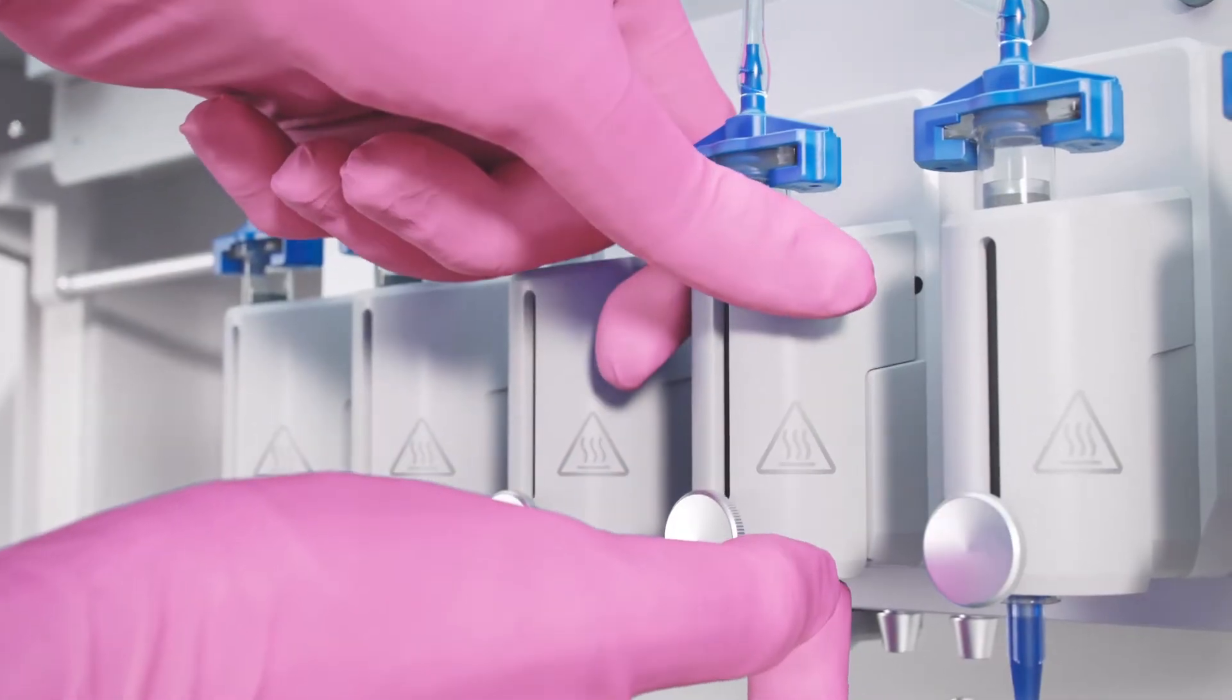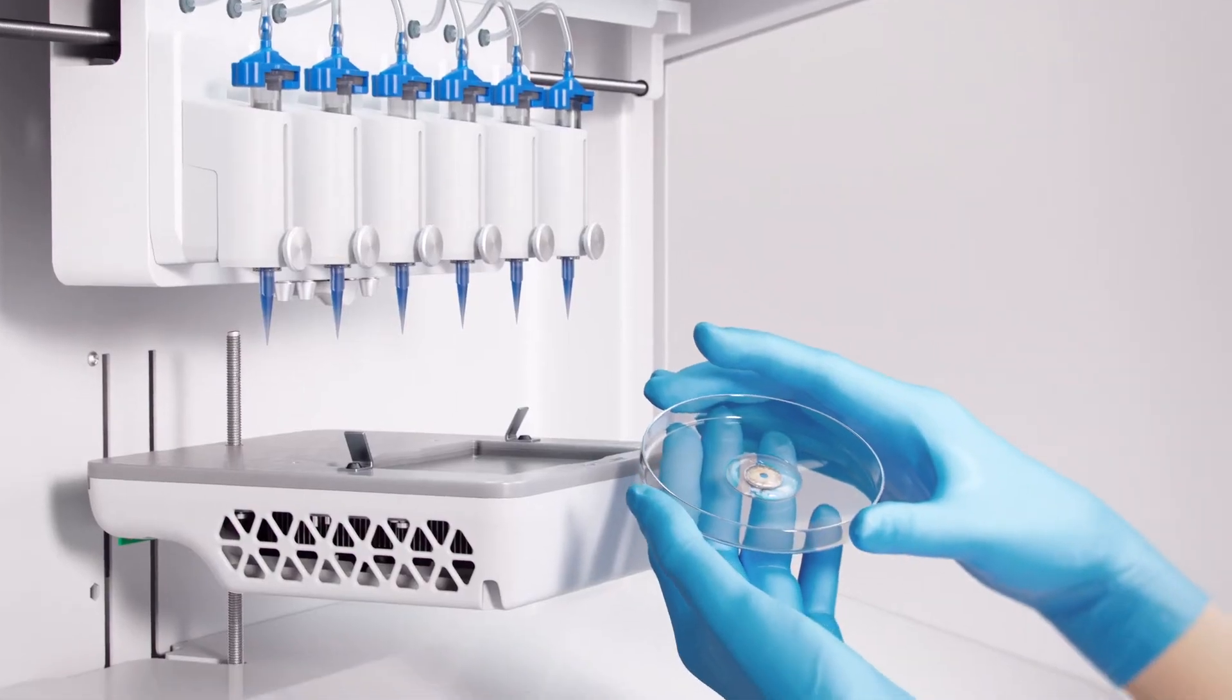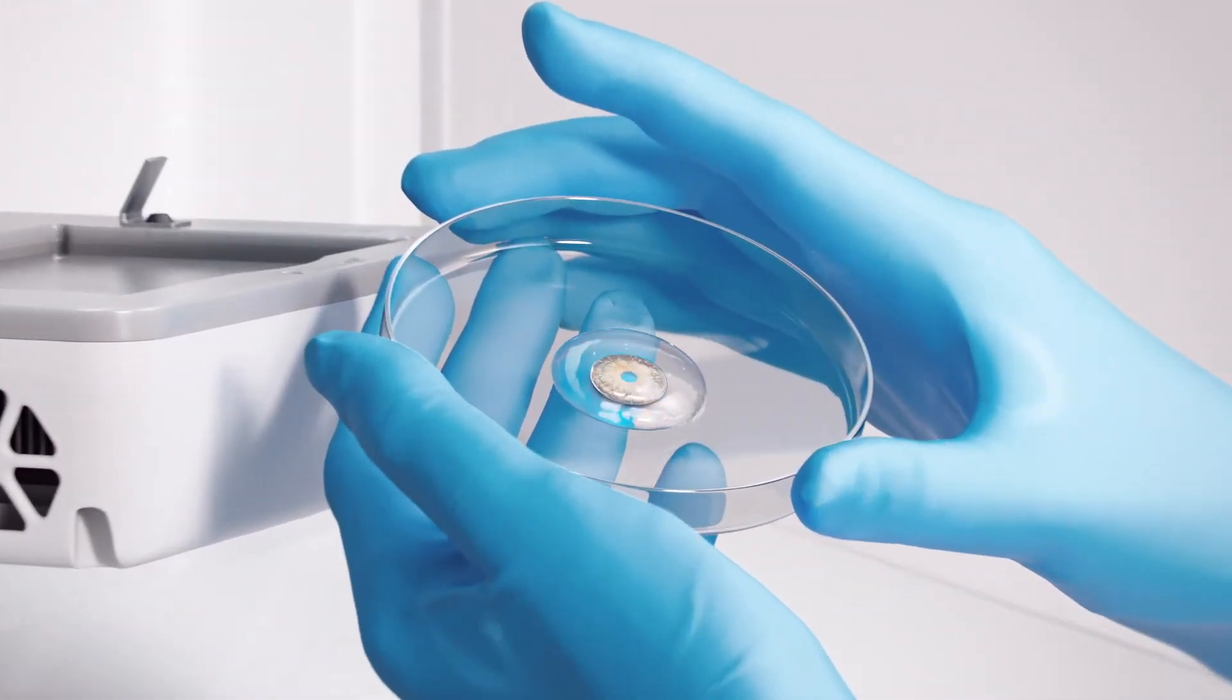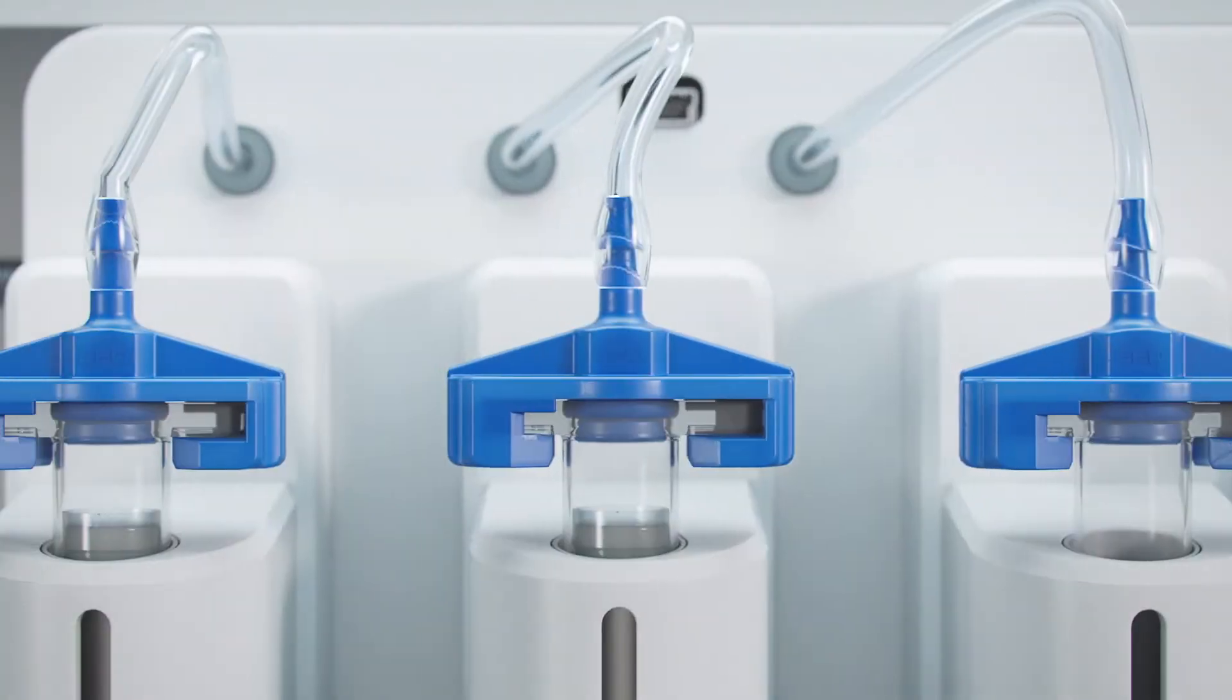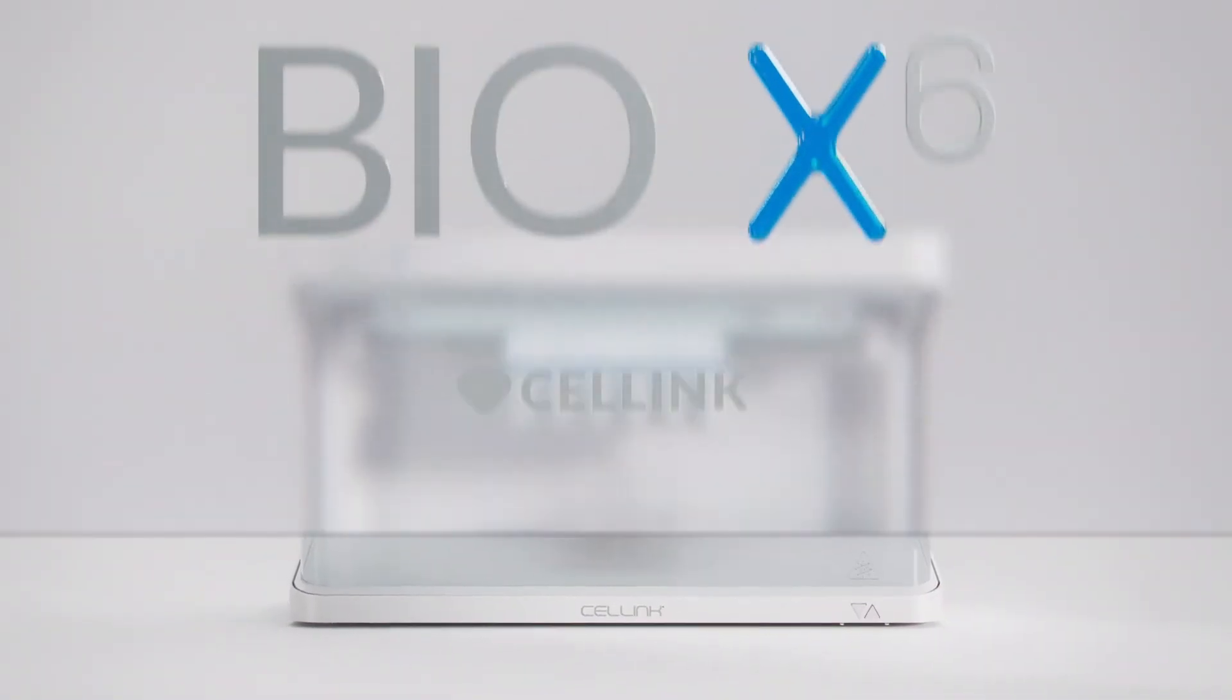Thousands of labs across the globe are now using CellInk's products and are making incredible breakthroughs in medical science. Bio X6 is leading us to an extraordinary future in medicine. Where will it lead you? Start printing.